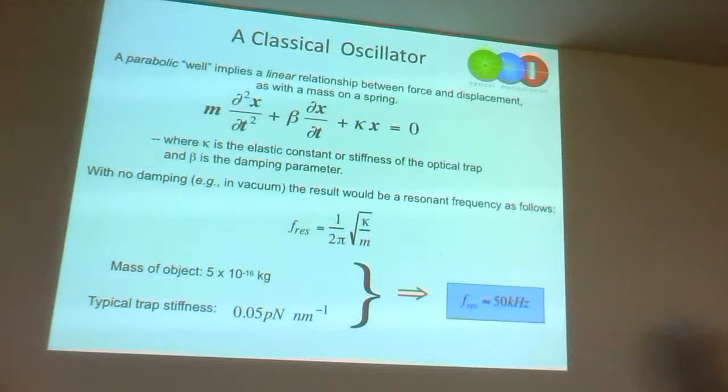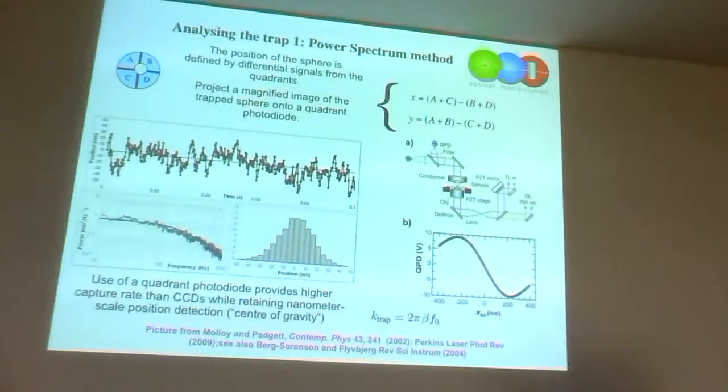So it turns out that a little particle in this Gaussian beam is rather like a perfect little Hookean spring. And how do you measure this? This is very interesting because it links to what Colin said this morning. Remember PALM and STORM, what they do is they sparsely illuminate, so we can measure the center of gravity of this one. Then we turn something on and then something else gets illuminated. We can tell the precision of an individual object very accurately.